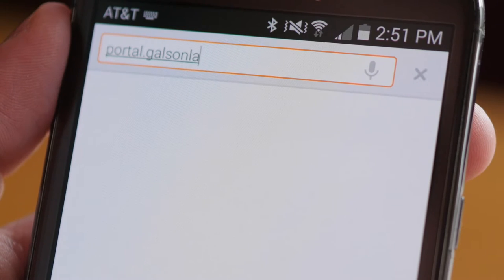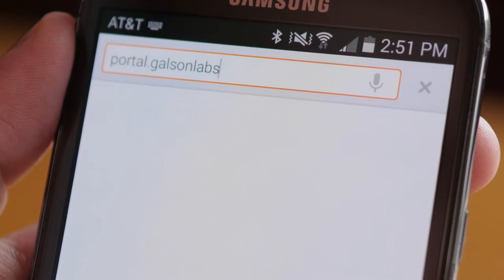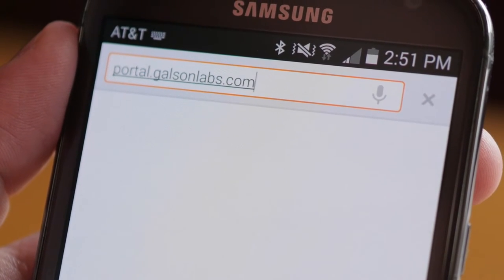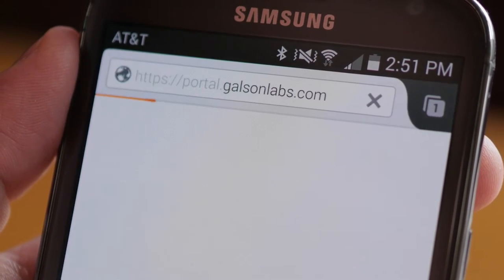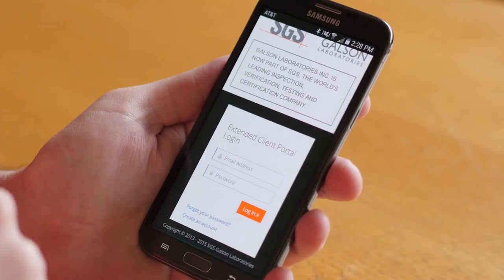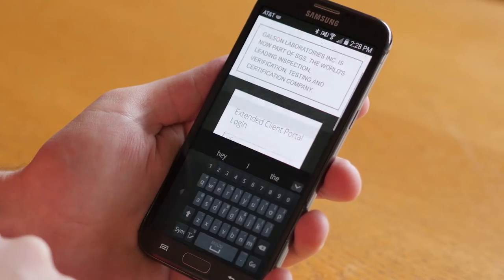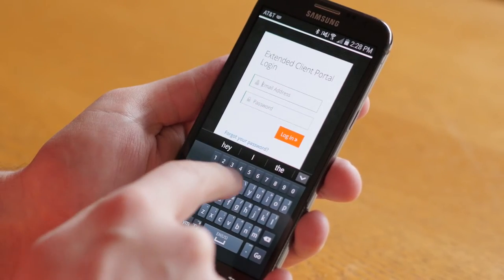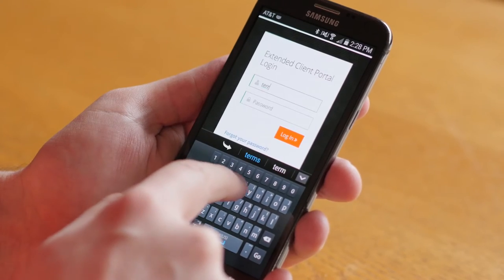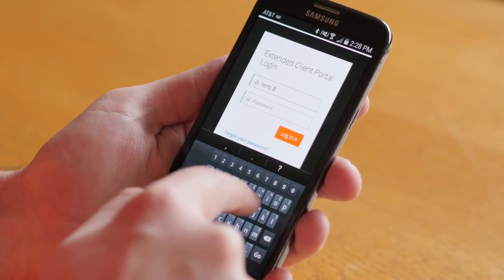You may start using the online chain of custody today by logging into your client portal account at portal.galsonlabs.com, free of charge. Additionally, you may log in via the link provided in your Shipping Notify email or from our main website.